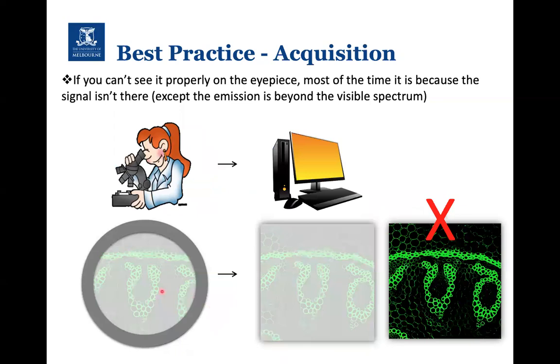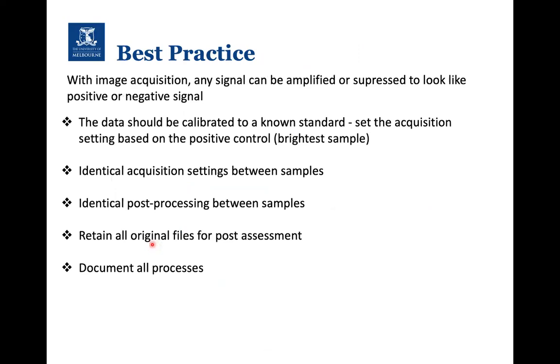What you don't want to do, and which is very easy to do within the confocal software, is to have a not so good sample through the eyepieces, which, if you increase your laser intensity and your gain, produces a beautiful confocal image at the end. So what we want to make sure is we spend as much time as possible at the start, maximizing our stainings and our sample preparation so we get the best possible resolution.